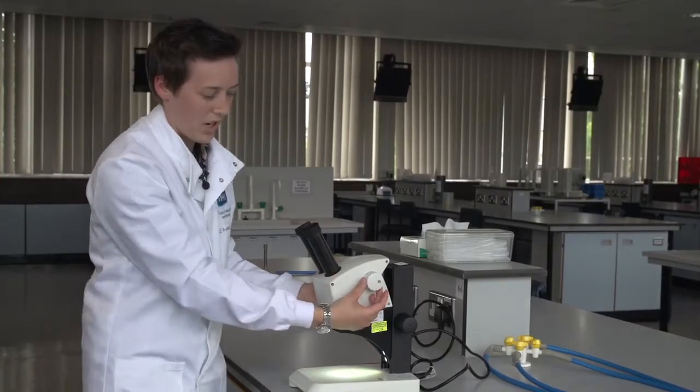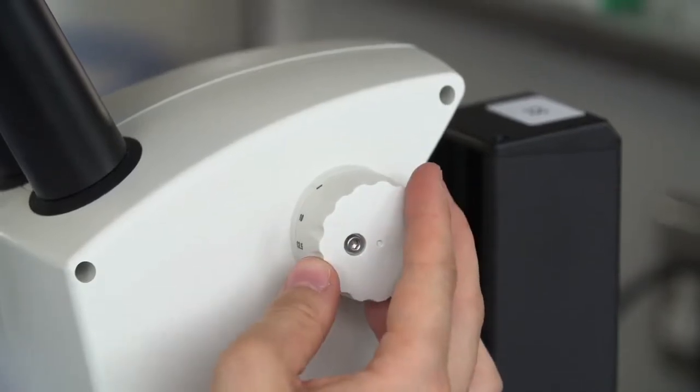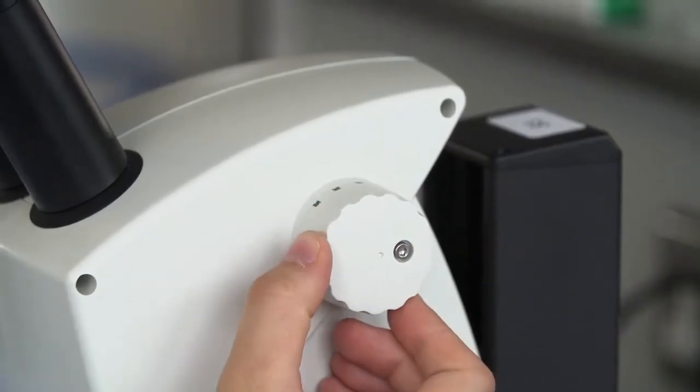We then have the magnification knobs here and these range from eight times to 35 times magnification.